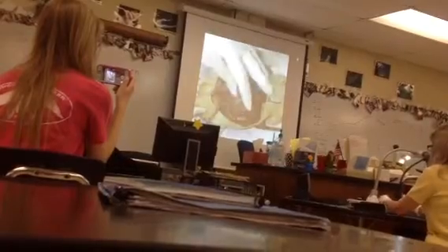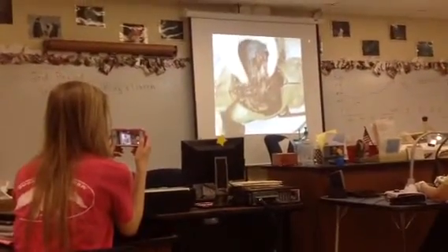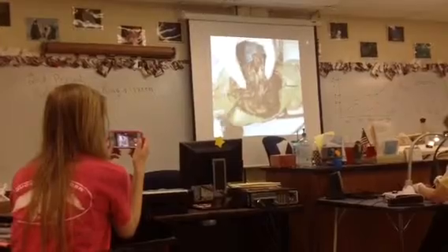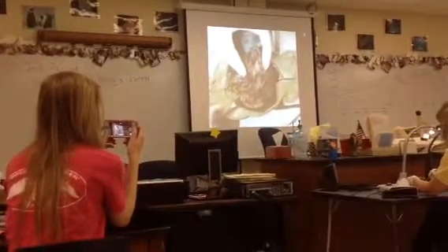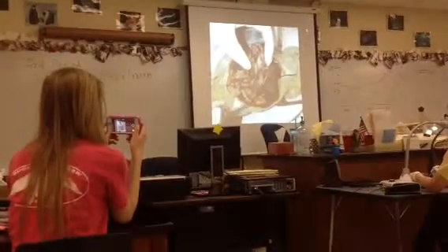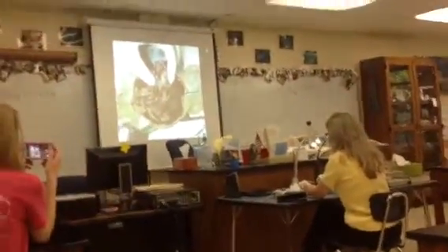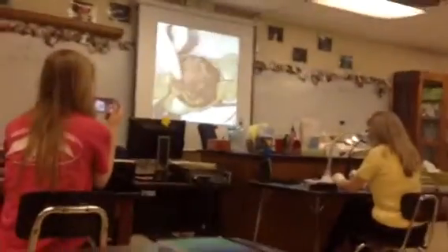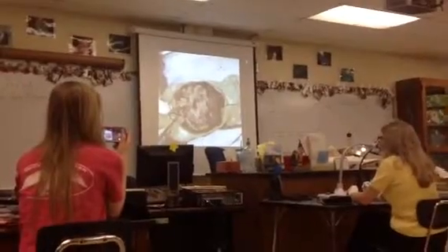And you're going to have to be able to identify the uterus. And the uterus forms like a Y. So it starts down here, and then it extends up each side. And those of you who had the females that were pregnant, look at how skinny that tube is. So think how much it's stretched to have all those babies in it. So that's the uterus. Then in either the male or the female, this is the urinary bladder.